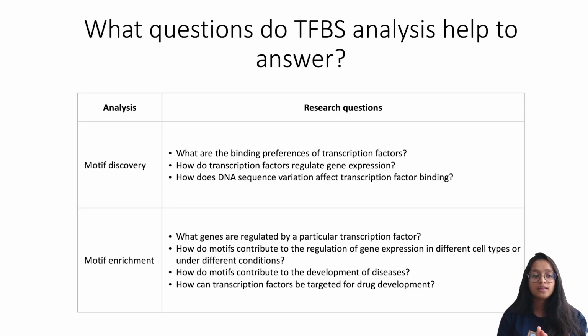This is to say that it is possible to perform both these analyses together. You can also perform motif discovery and find whether the motifs that you find are enriched in your regions of interest. It is possible. In addition to that, there are also several other analyses that can be performed. So this is just a very broad and simplified classification, but there are a lot more analyses and combinatorial approaches that can be taken.